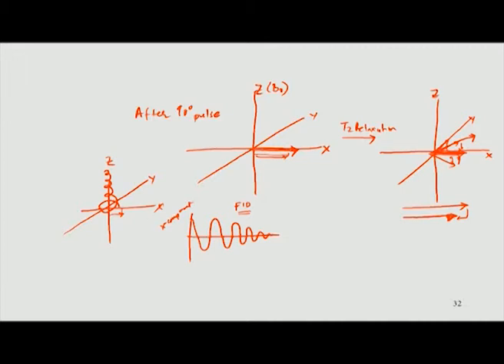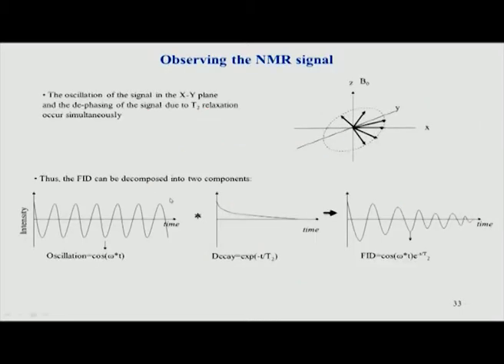This is the FID which I showed in the previous class, in a previous slide, and you see what is happening here. This is basically an oscillation plus a decrease. So, we use the word damped oscillation. Let us look at this now with this in mind. How does this look? The FID is shown in the next slide. So, this is shown here, and we can see this is the FID which I showed earlier.